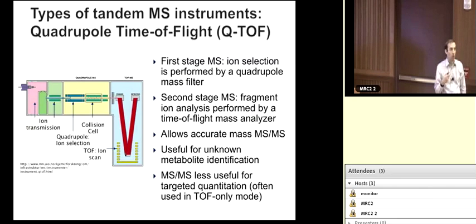The good news is the core lab, if they don't make that choice for you based on how you decide, is going to at least provide a lot of useful advice that will let you pick an analytical method that will be best suited to your analysis.